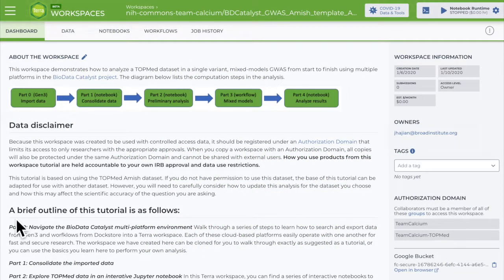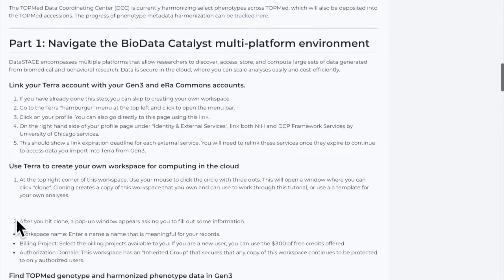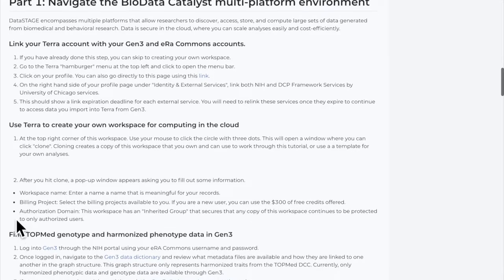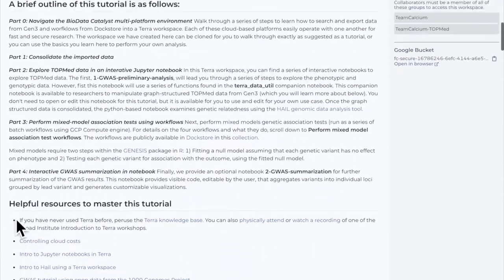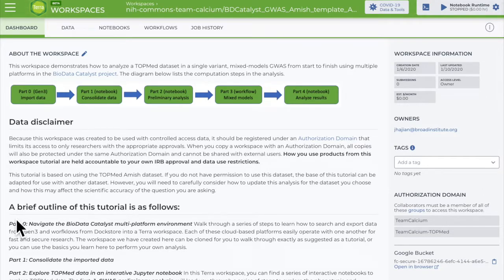I'm going to demo on one of my own restricted access workspaces, a tutorial for researchers with access to a particular dataset. You can see the workspace dashboard page includes a lot of detail. Good documentation helps align all project collaborators and it makes an analysis easier to reproduce. You can edit the documentation, which is written in the Markdown language, by clicking on the pencil icon at the top of the dashboard.